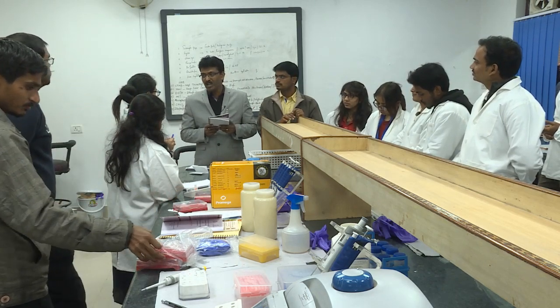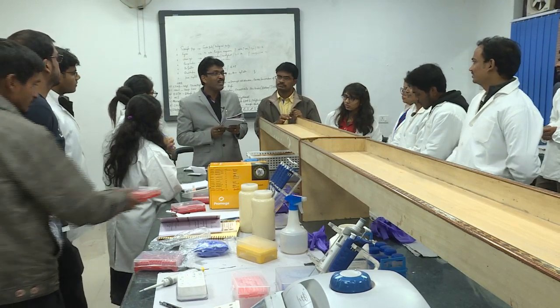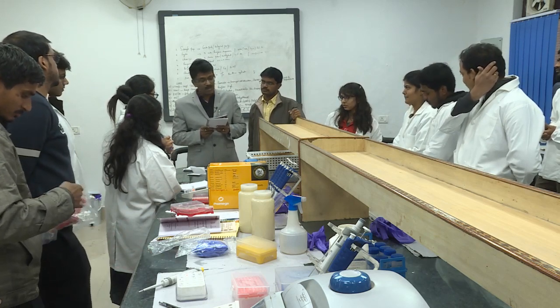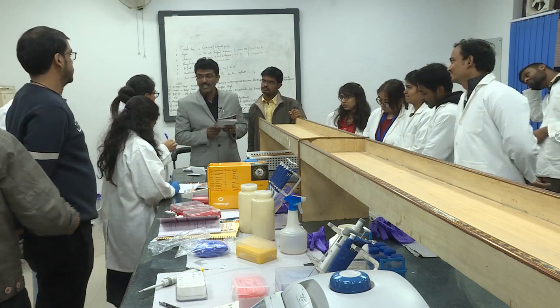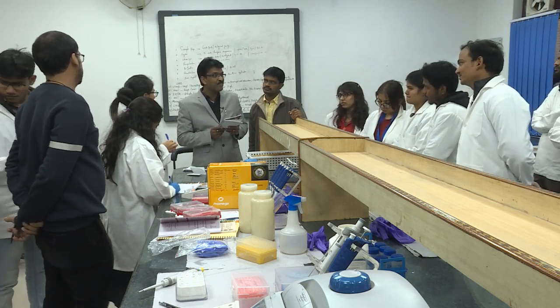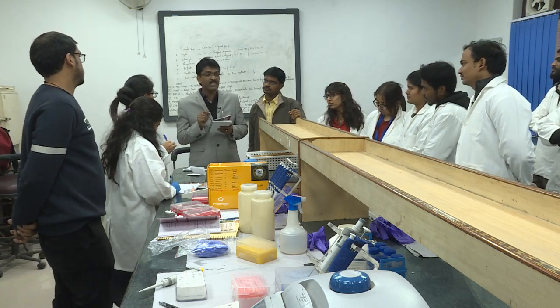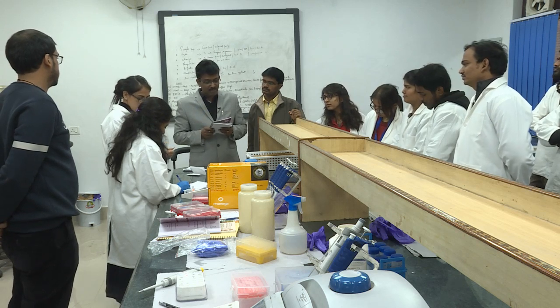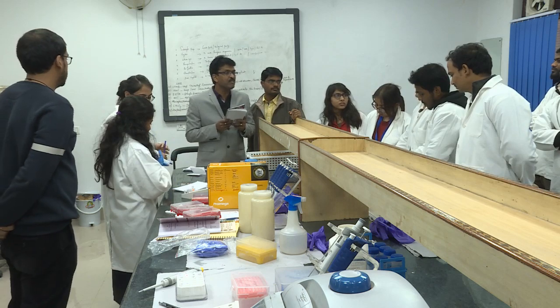So they have no option now. They have to normalize the DNA template to 50 nanograms per microliter. Since you cannot make 100 nanograms per microliter from 93.3 nanograms per microliter, there is no other option now. You go for 50 nanograms per microliter, the template. Okay, do it now. You have to set up a PCR. Okay. Any other group who has completed quantitation?